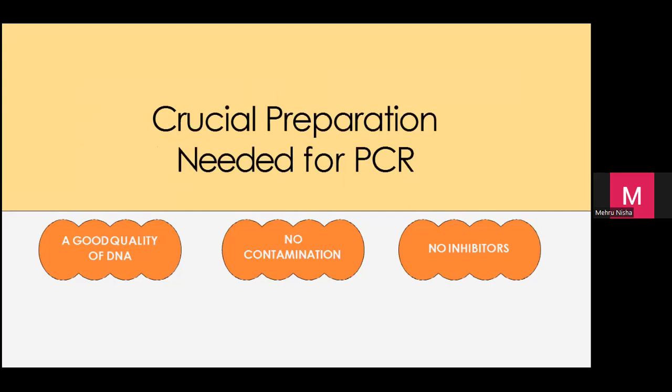Okay. So before I take a 5 minutes break, let me share with you all apakah kepentingan atau what are the important steps? Step yang banyak crucial untuk PCR. PCR actually is not difficult. Tapi kalau you tak dapat results, you pening. Sebab you don't know from where you want to start. Adakah DNA saya ada contamination? Adakah enzim saya tak bekerja? Atau mesin rosak?